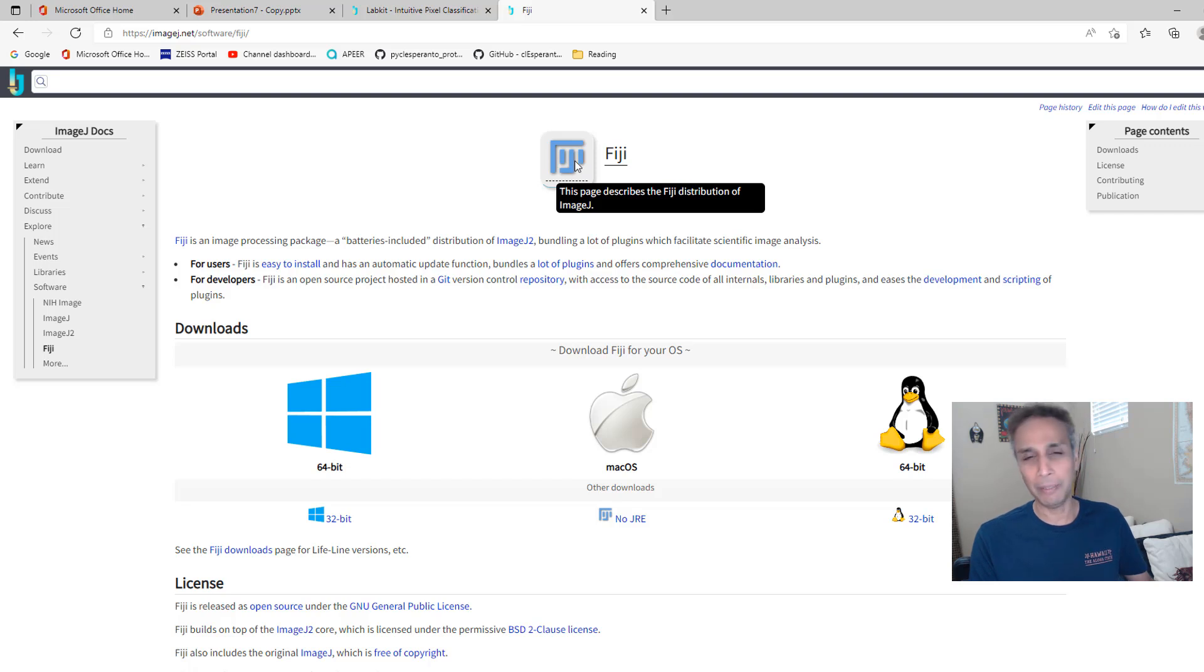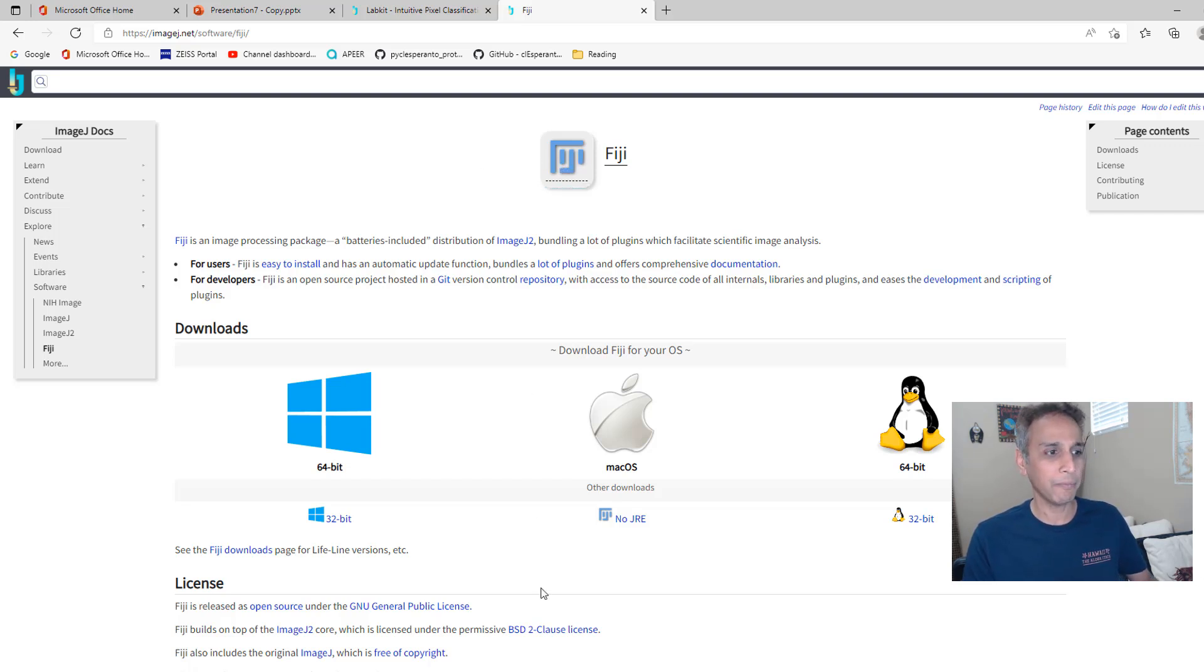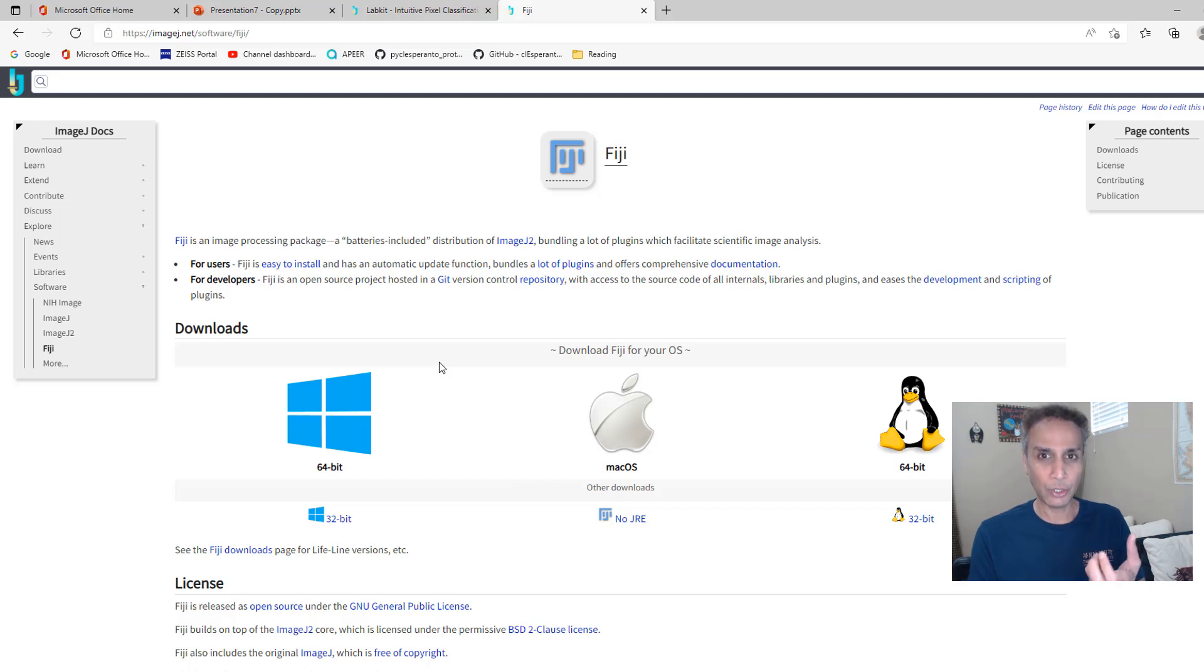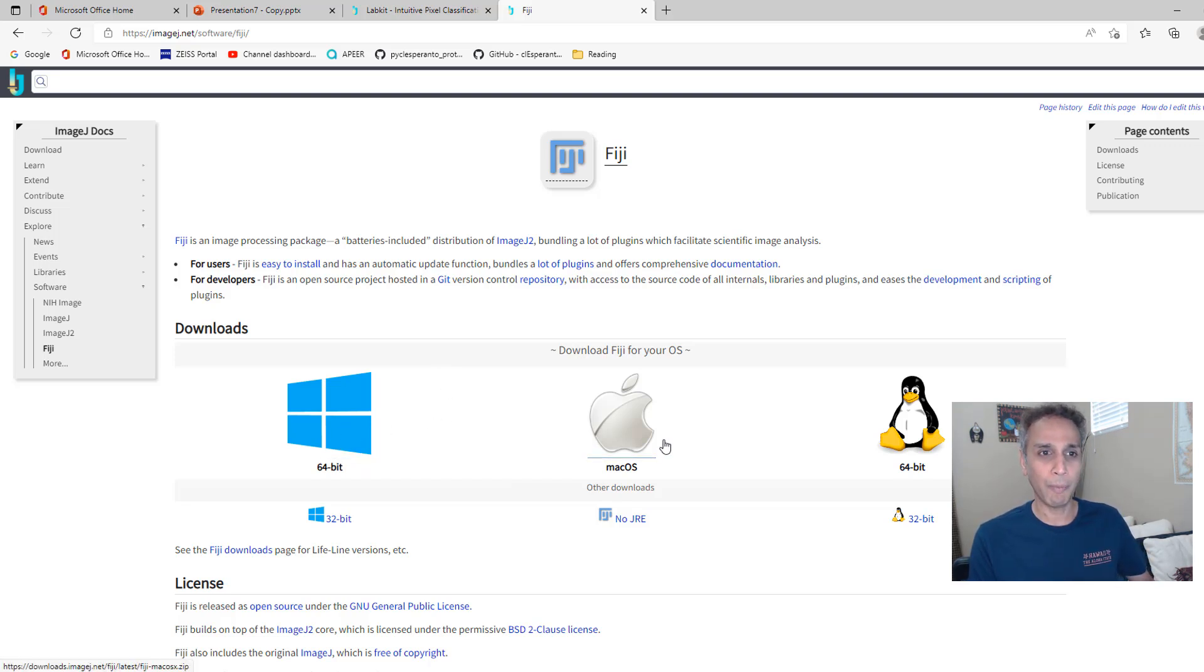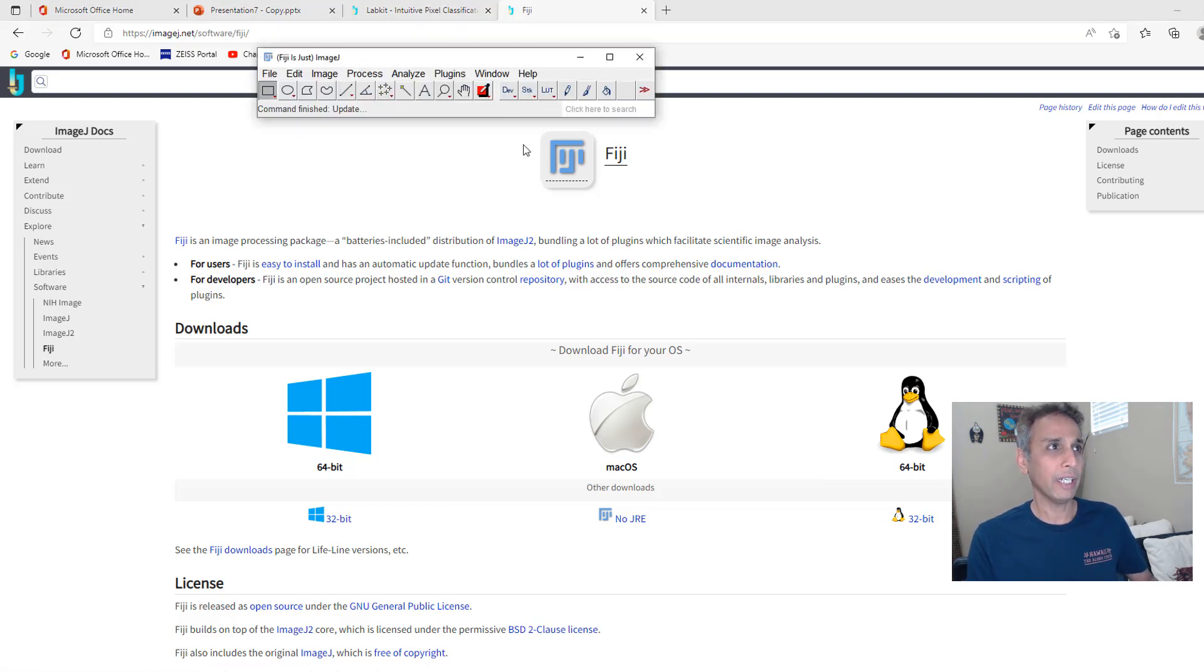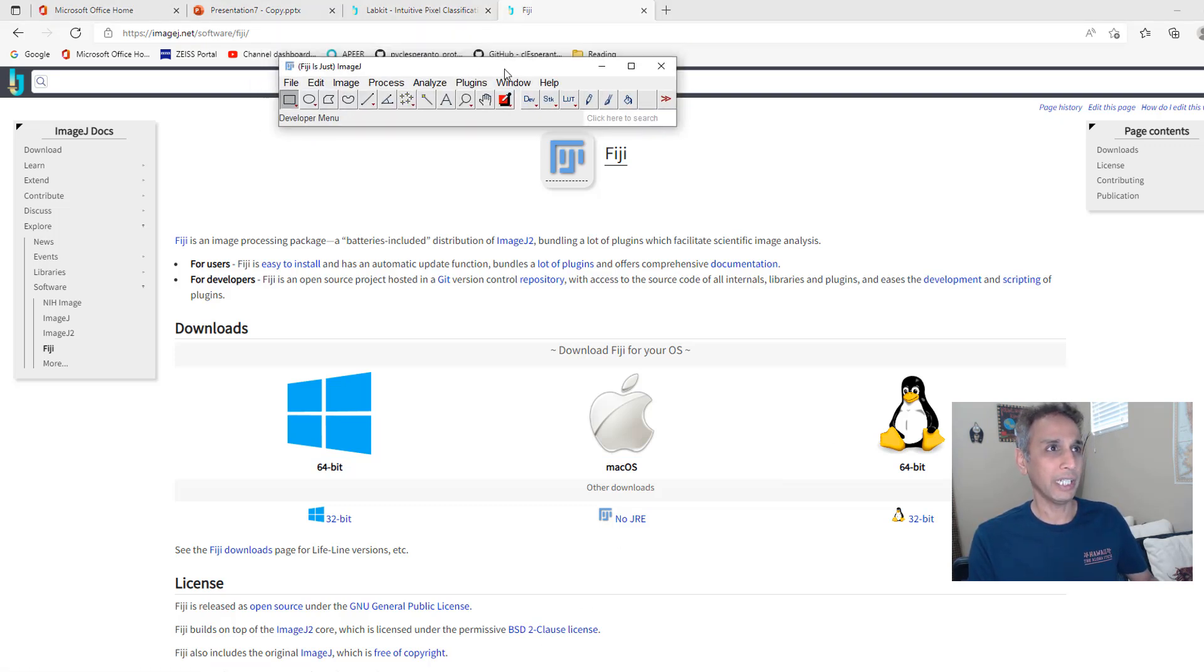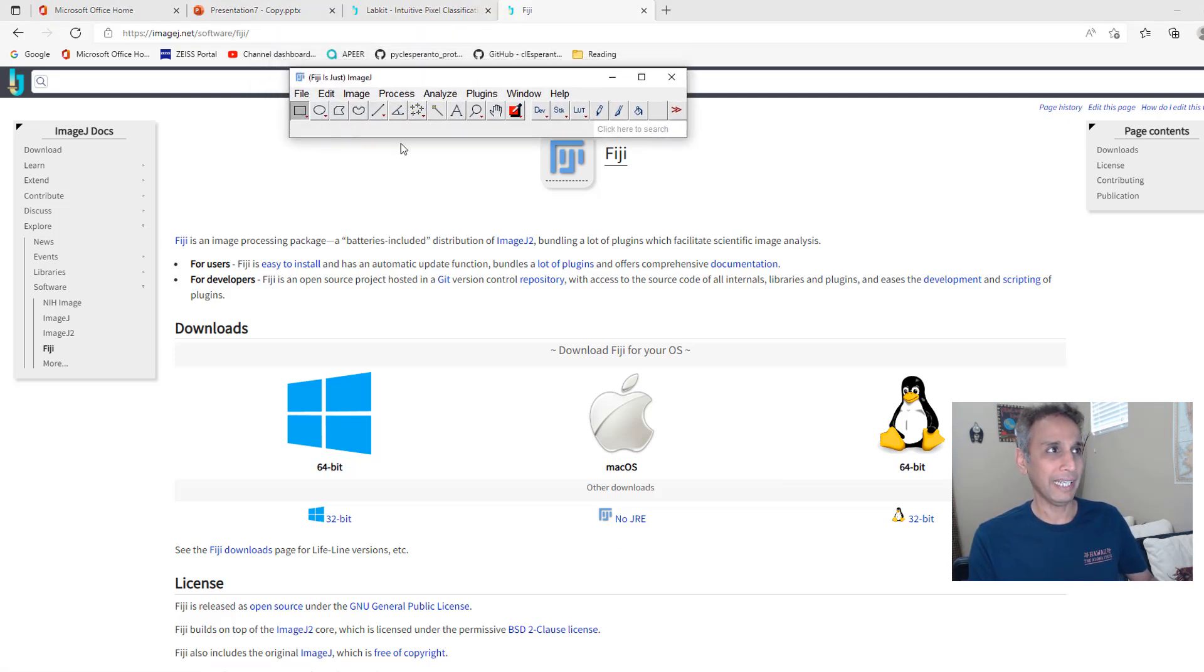Go ahead and download ImageJ or Fiji, it doesn't matter. Eventually what you'll end up with is an executable that you can execute in your Windows system or Mac or Linux and when you fire it up, when you open it, it looks something like this.